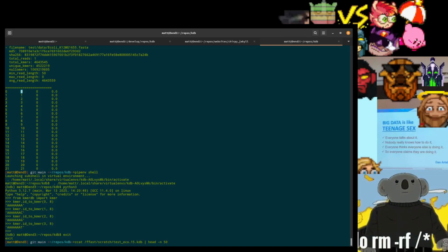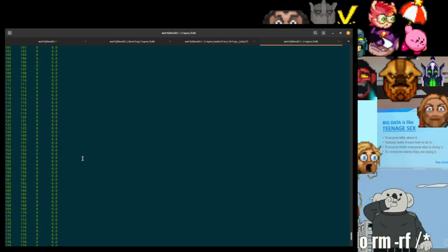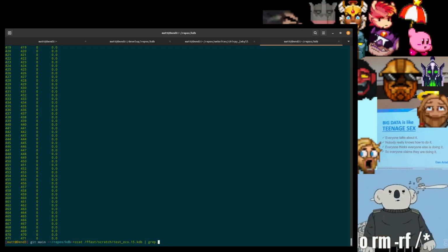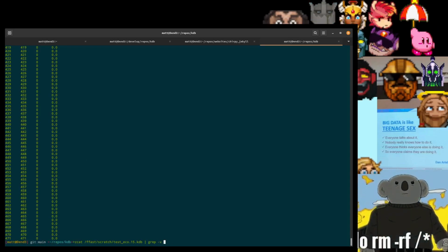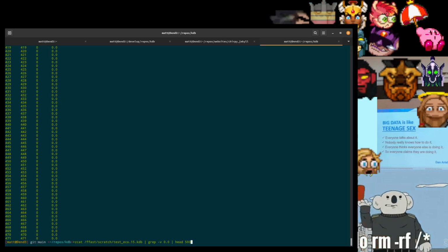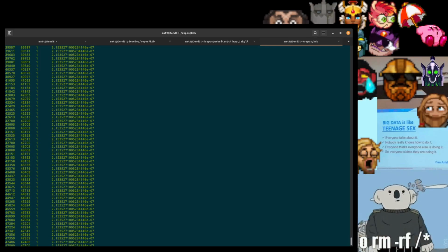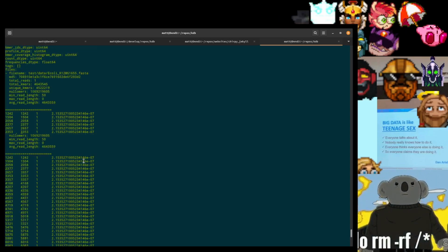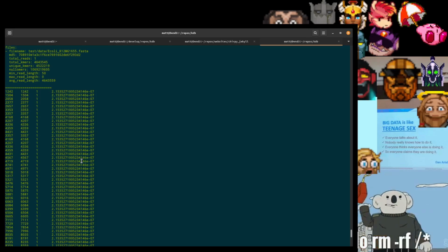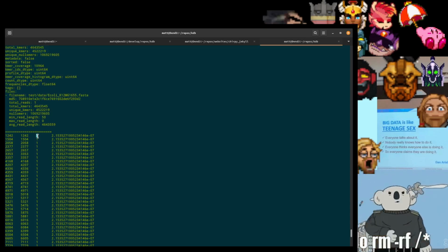Anyway, if we look at 500, for example, we're still not getting anything interesting at all. But if we grep for non-zero, grep -v 0.0, and take a look at the first 500 of those, most of these are unique non-null kmers that have exactly a count of 1.